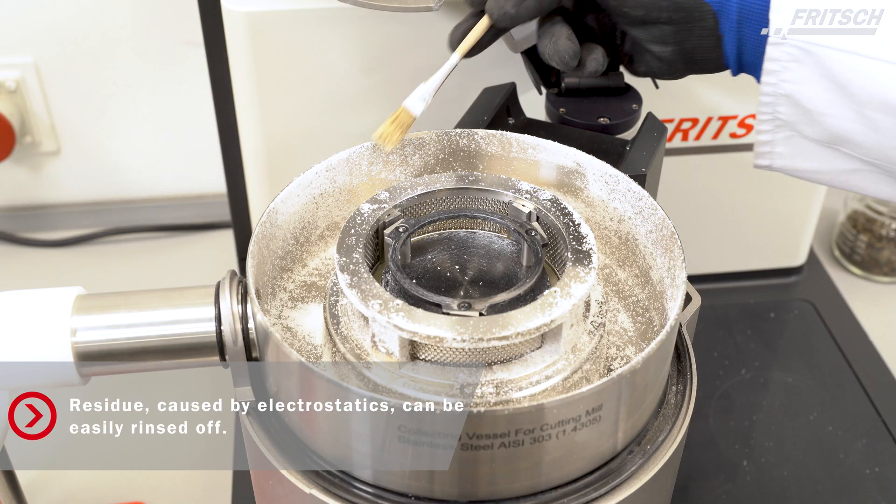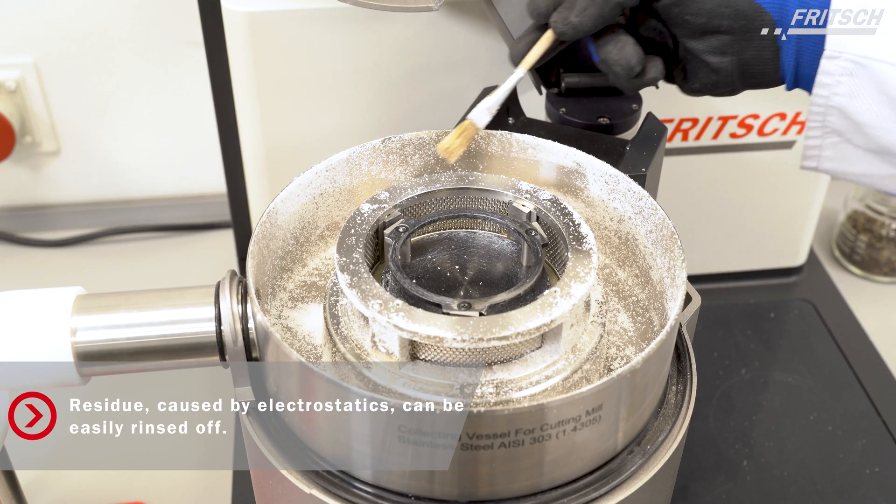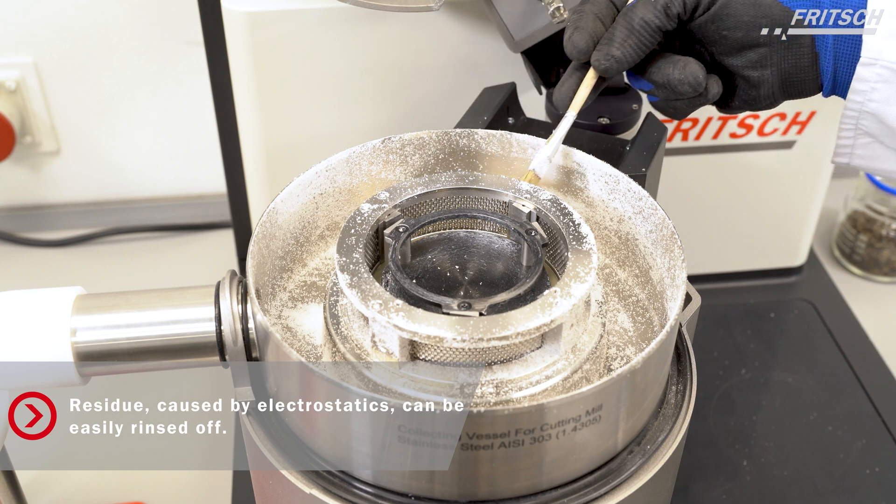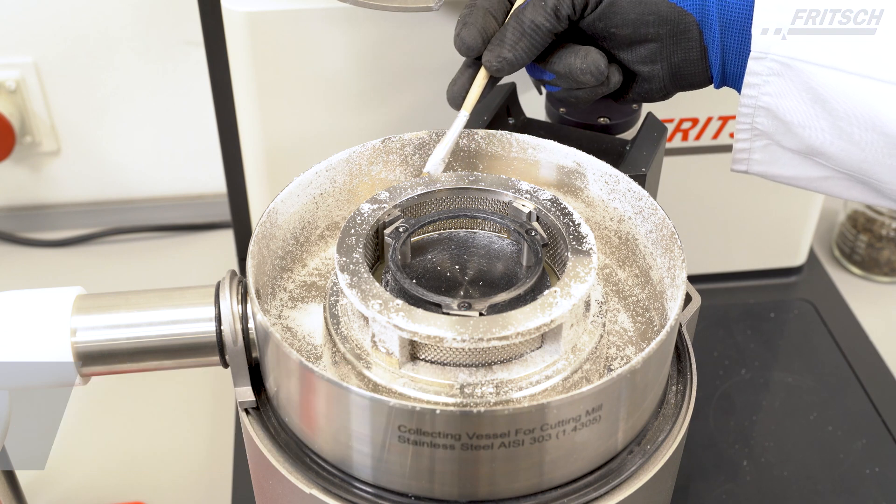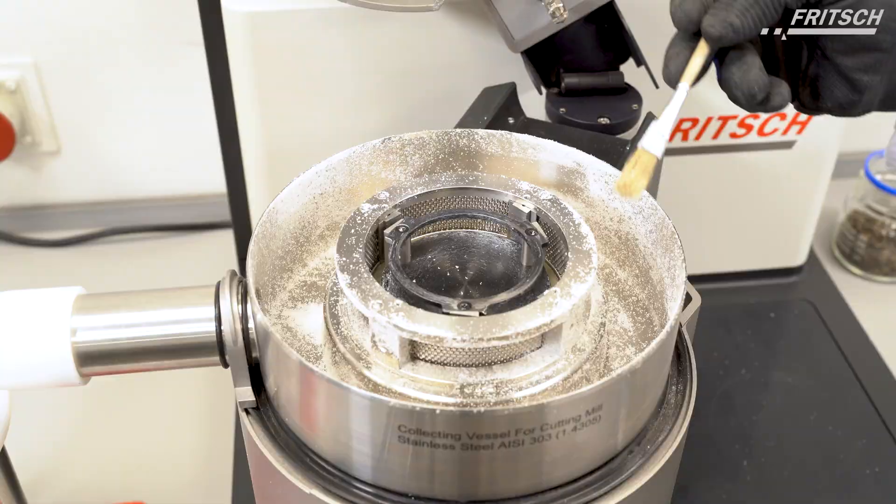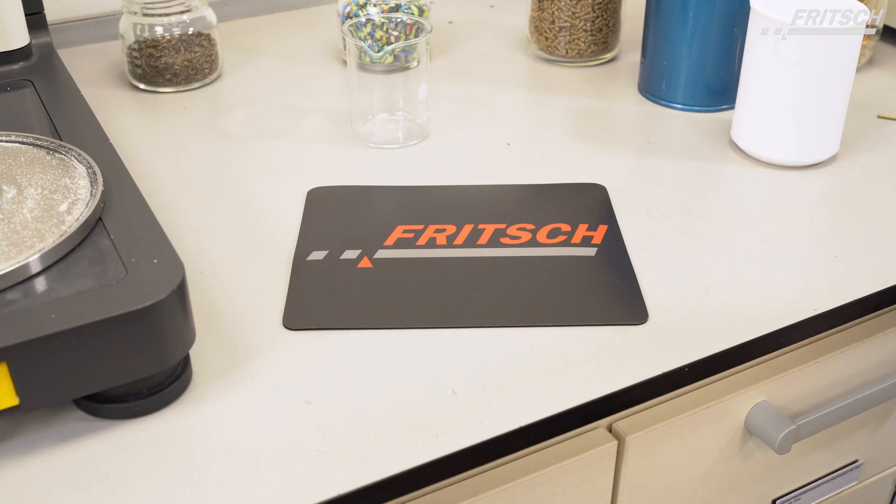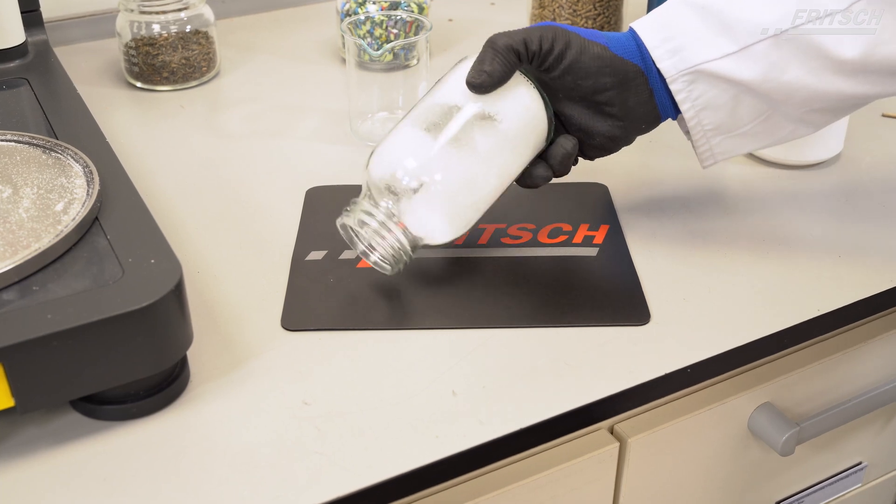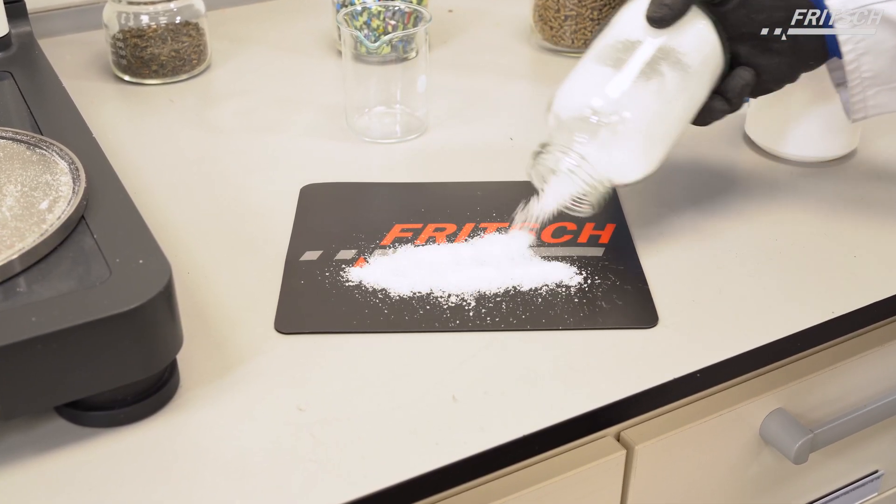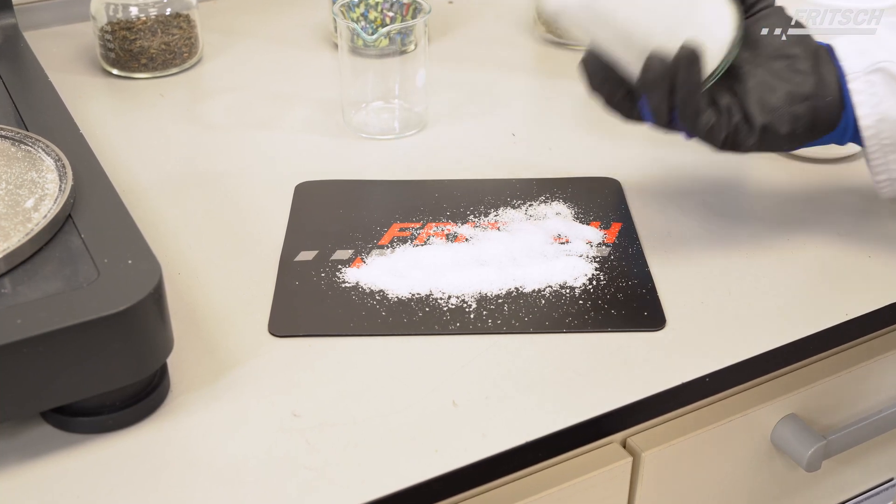As you can see there are no residues on the sieve shells and higher quantity can be ground. This was a successful grinding with a Pulverisette 14 premium line with a cutting rotor.